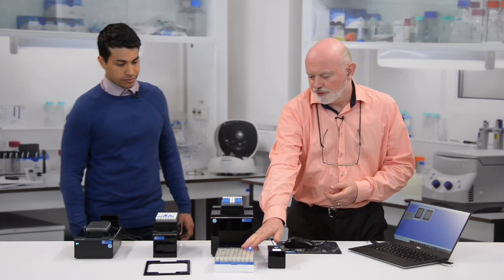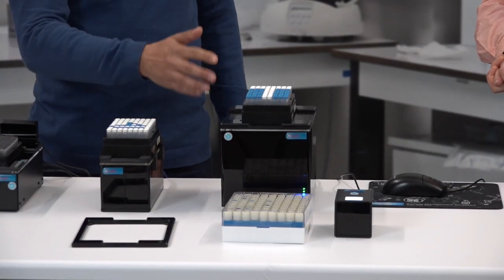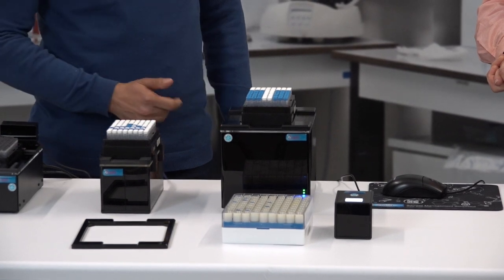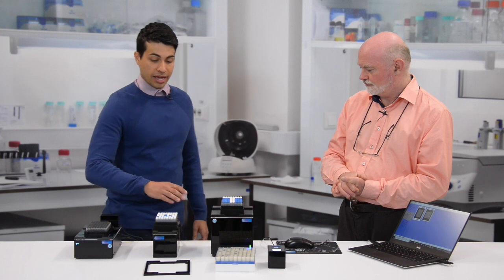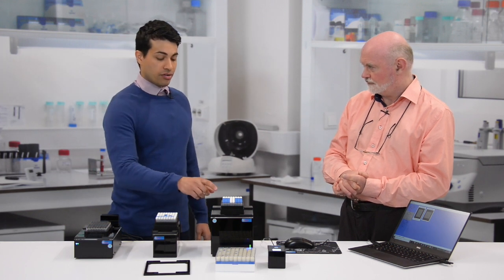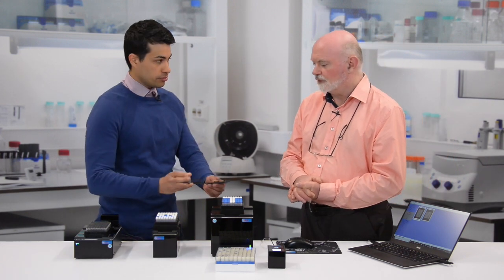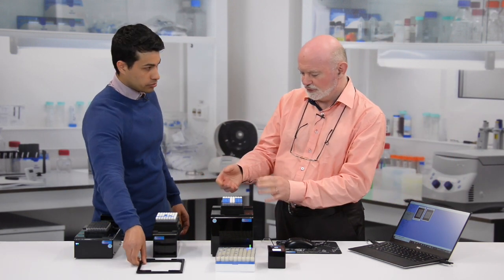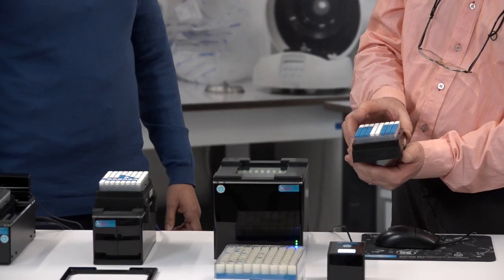If I've got a cryo rack, which one can I use? For cryogenic racks, we recommend the Cube scanner. This is our most versatile scanner out of the three — it can scan cryogenic racks and it can scan SBS racks as well by a simple change of the mask. These masks are interchangeable and they just clip onto the top of the machine.